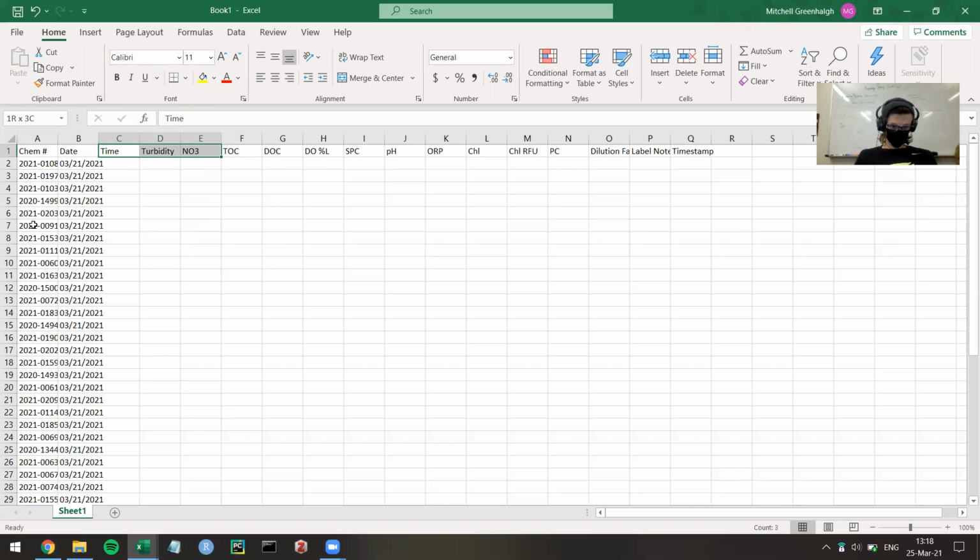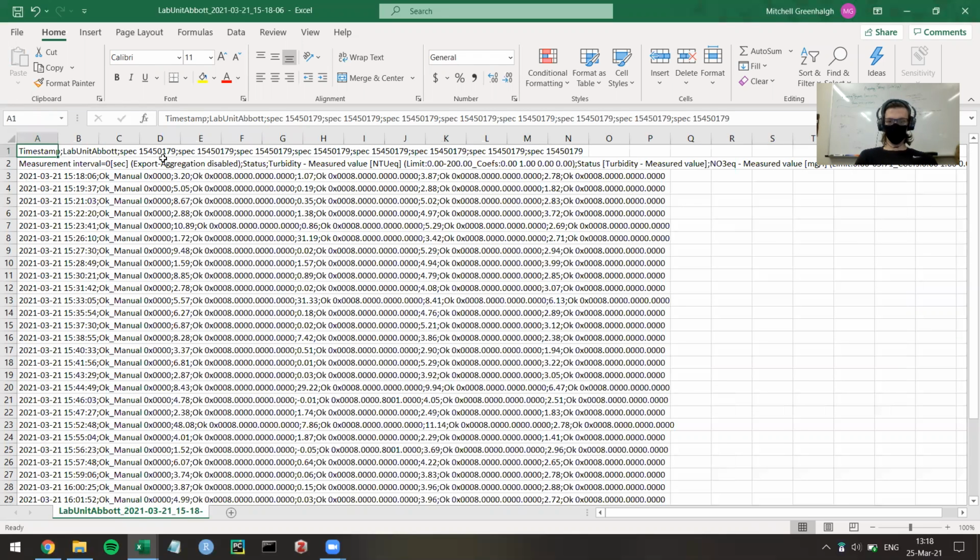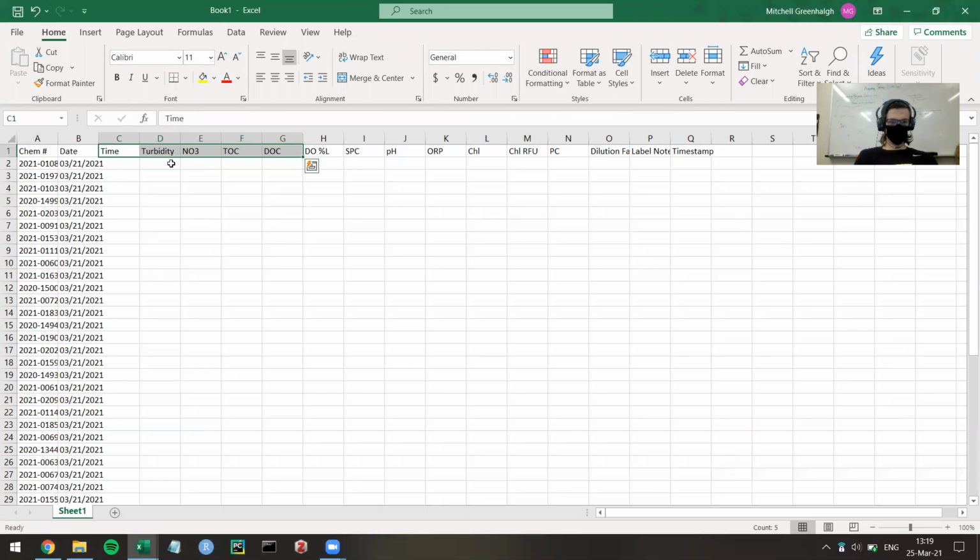And all of this data is also stored in the file that we export from the scan console. So that's where we don't technically have to type everything out manually. If you do type it out manually, we're supposed to go into this file anyway and double check that everything was right. That's not that bad for small quantities of samples being run. But otherwise it is easier and more accurate, with less human error involved, if we just do it this other way.